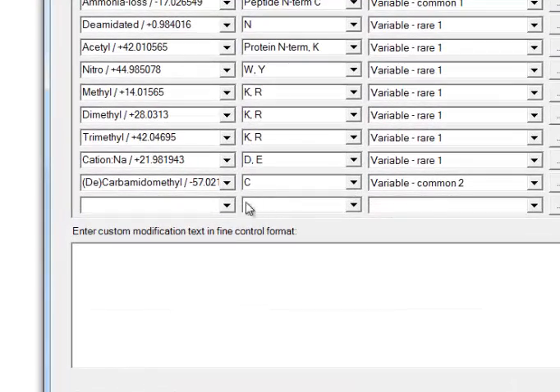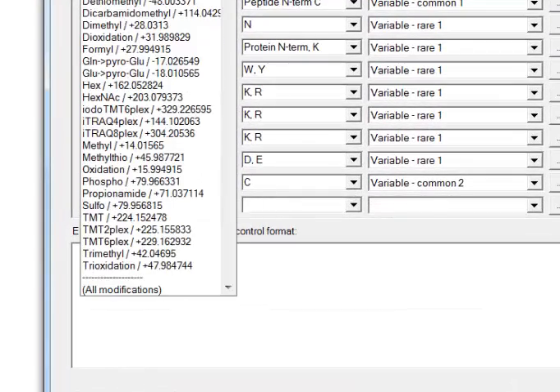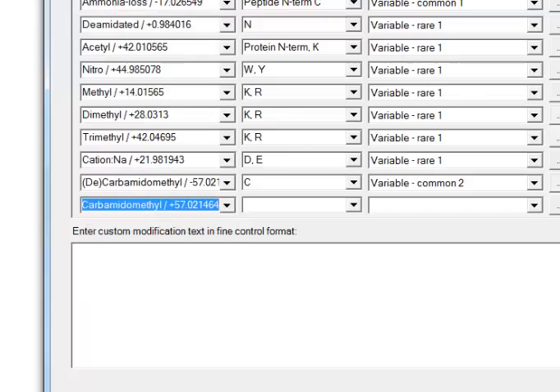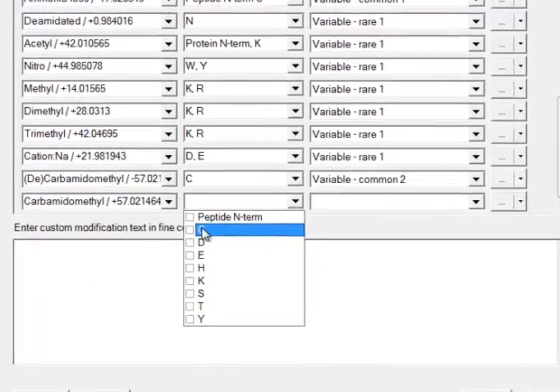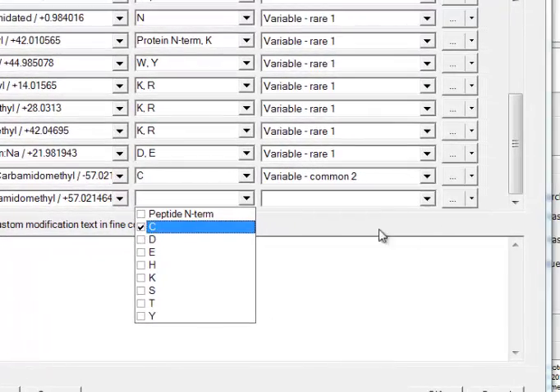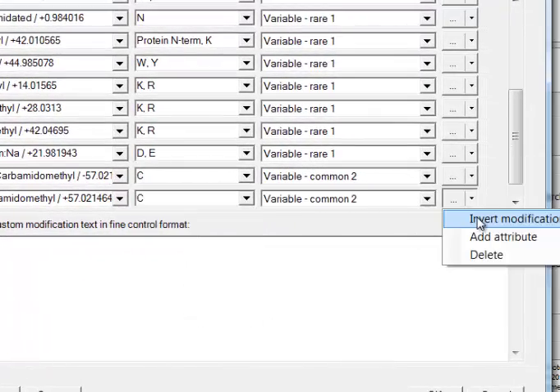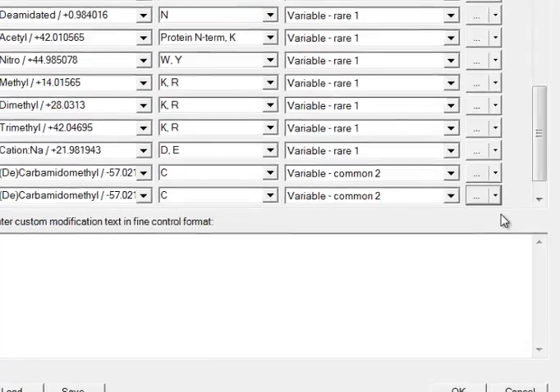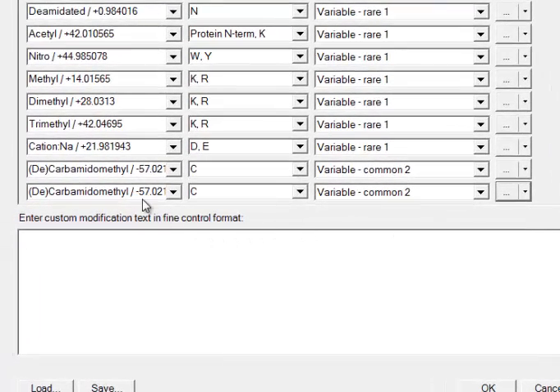Now I'll show how we set decarbamidomethylation. We scroll down, we choose carbamidomethylation, we say 'invert modification,' and that sets it to negative instead of positive.